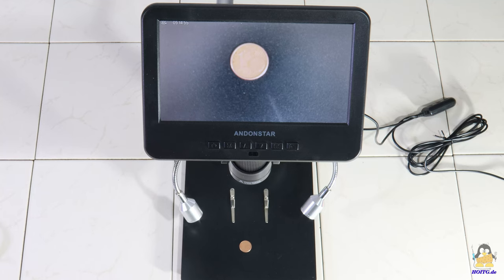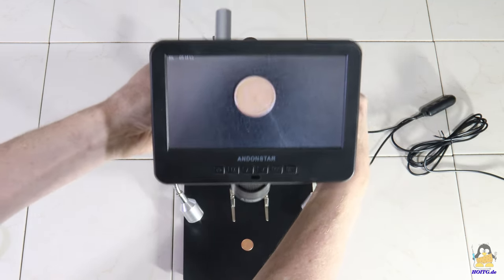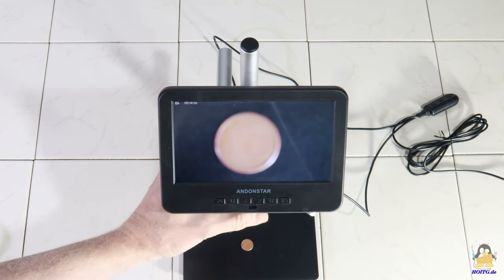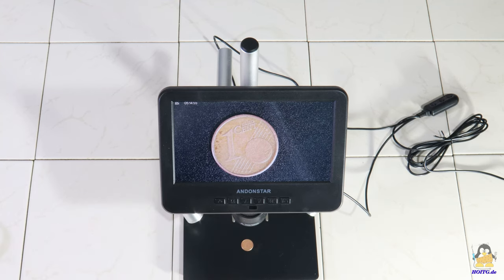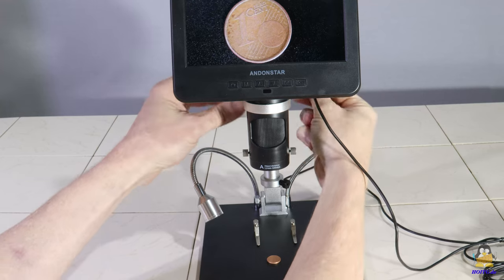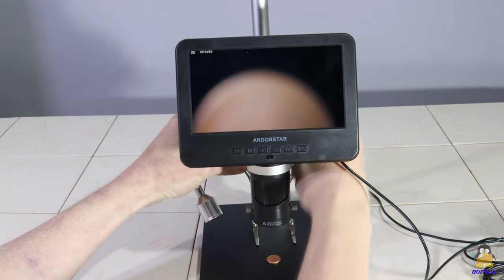The lens fitted first allows focusing at distances from 12mm up to 320mm. The closer the lens is to the object to be observed, the higher the resulting magnification.